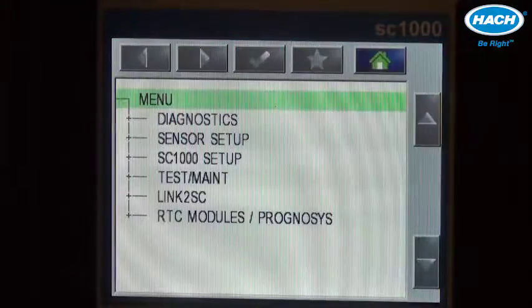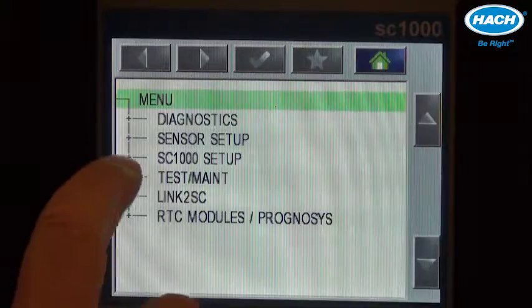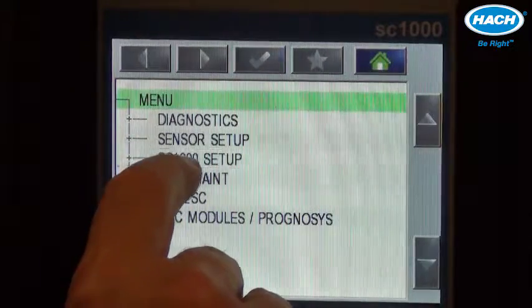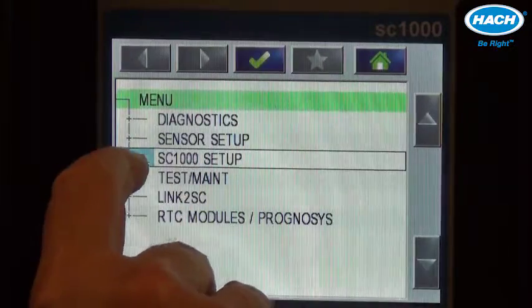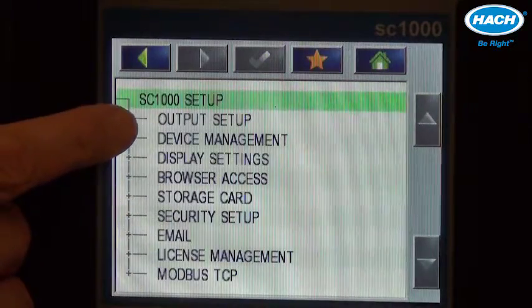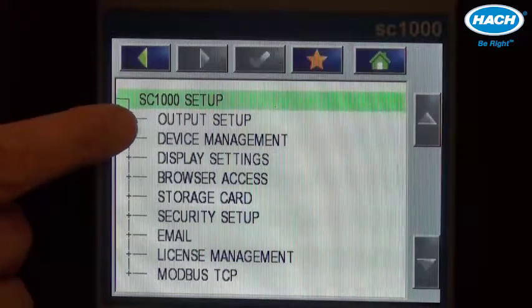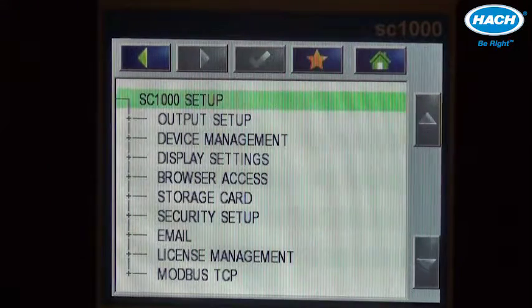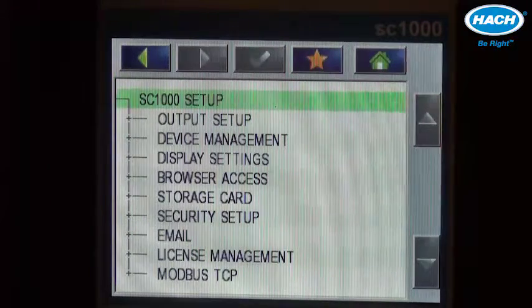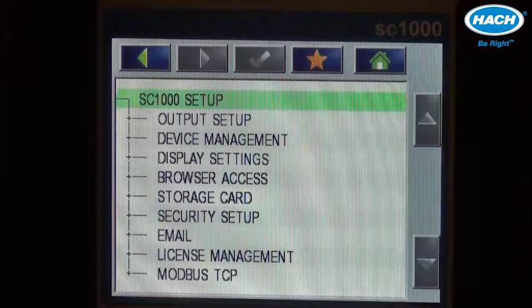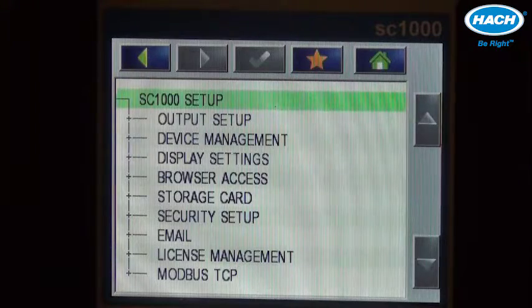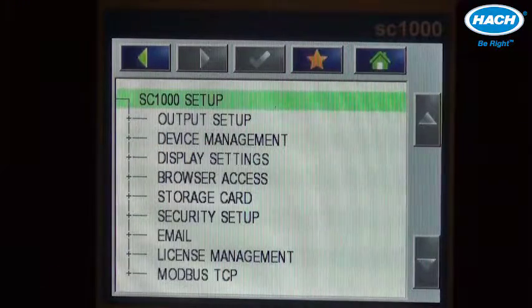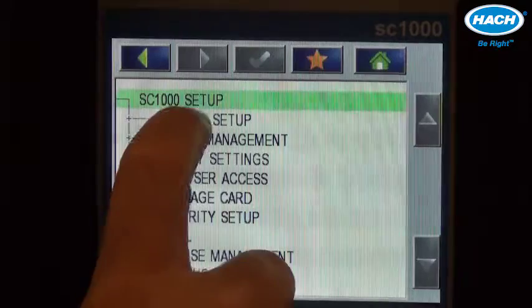We start by pressing the main menu and scrolling down to the SC1000 setup where the output menu resides if an analog output module is installed inside the SC1000. If it is, you'll get an output setup screen.